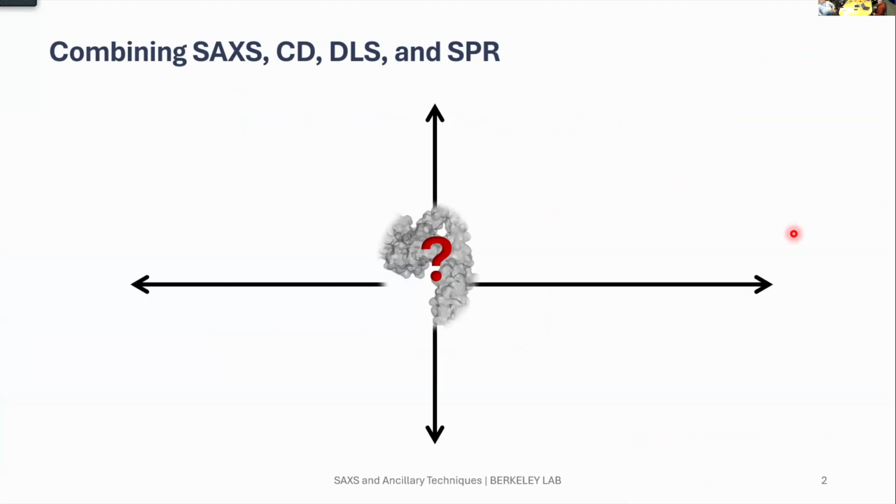Central in our work is characterization of protein solution, right? Regarding our research objectives, we want to know as much as possible about its state, whether it's some structural changes due to conditions or some type of interactions.